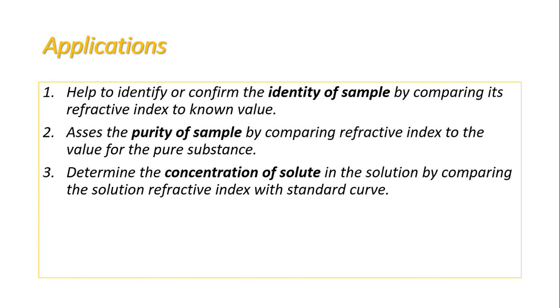Also, it helps us assess the purity of a sample by comparing it with the pure reference substance for this sample, and determine the concentration of solute in a solution by comparing the solution's refractive index with a standard curve. We have the standard curve, and from it we know the concentration of solute.